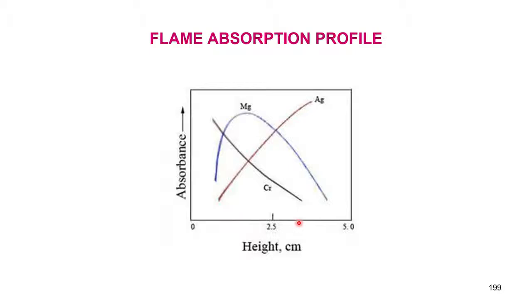There is a certain range of height that should pass through to get optimum absorbance, correct. So, in atomic absorption, they always give you a small screw at the bottom of the nebulizer or flame burner, so that you can increase the height of the burner to desired level.